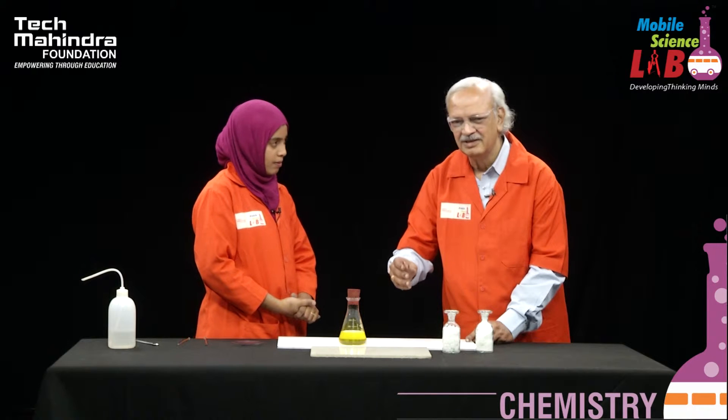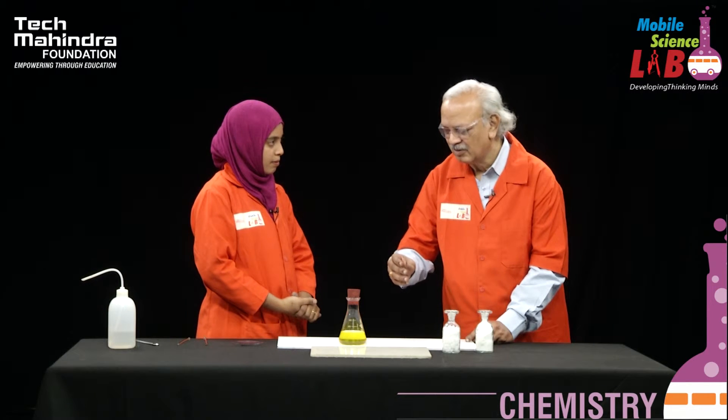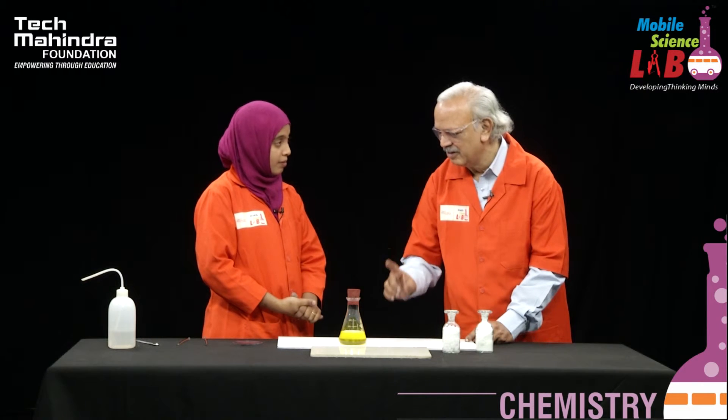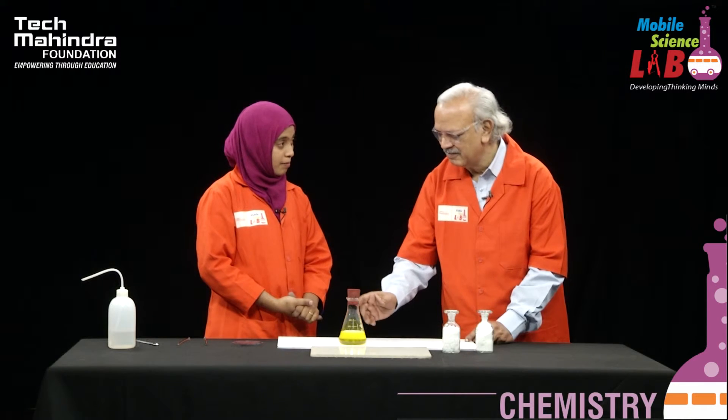In this aerial oxidation, the state of indigo carmine changes through oxidation states 1, 2, and 3. Each oxidation state corresponds to a particular color. A simple related experiment is the blue bottle experiment, where you get only one color. This is another variety where three colors are produced.